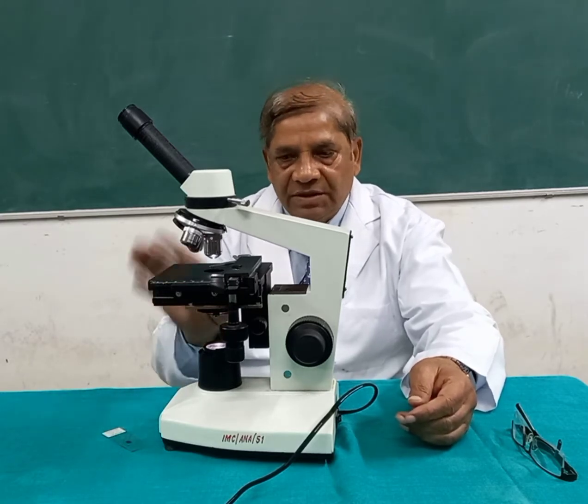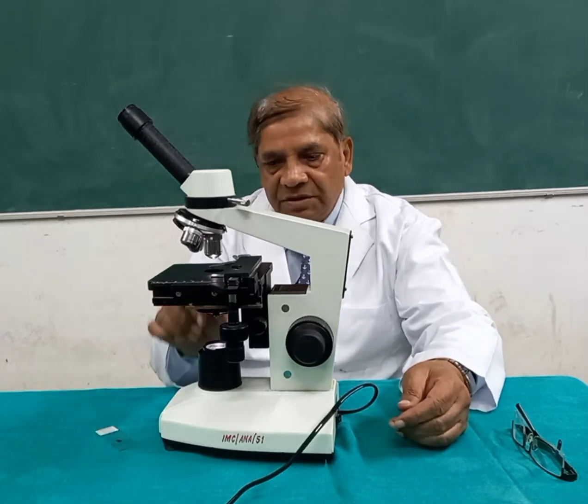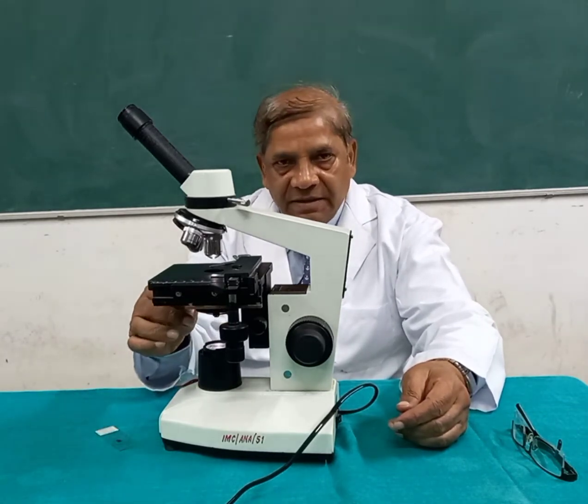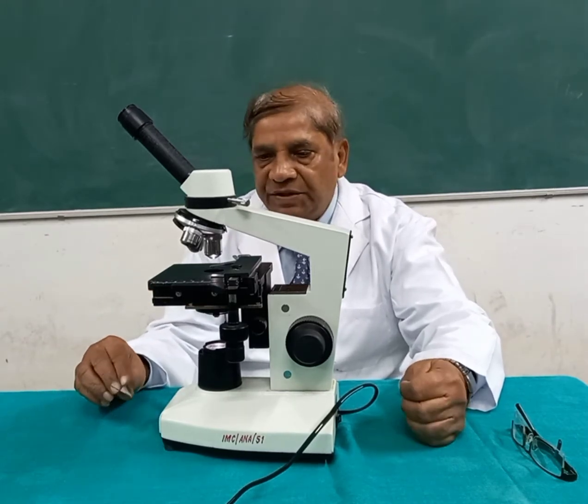Let it pass through the condenser, and keep the condenser a little upward, and the diaphragm completely open. Let the diaphragm remain completely open.